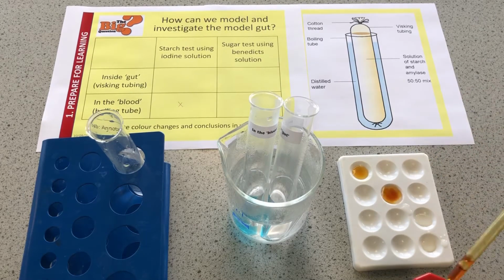So there we go. Inside the small intestine, all of the starch had been broken down by the amylase. Now it would have been all right if we'd found starch in there. It just would have meant that it hadn't had time to break it all down. But in this case, it had been left for long enough and all that starch has gone. The amylase has done its job.